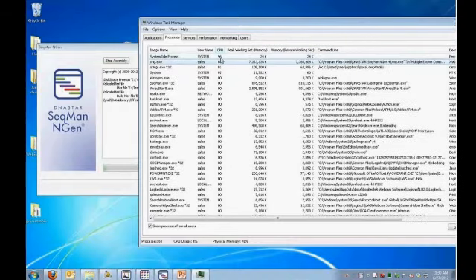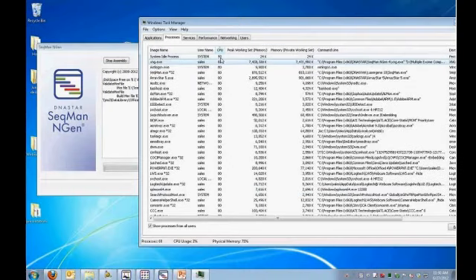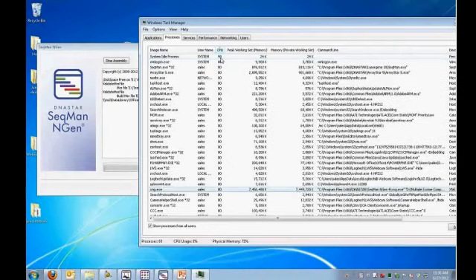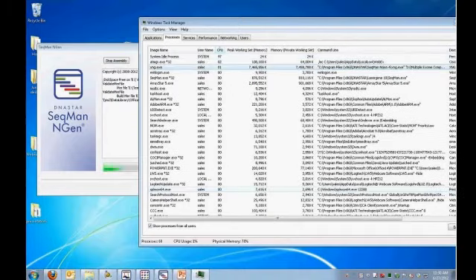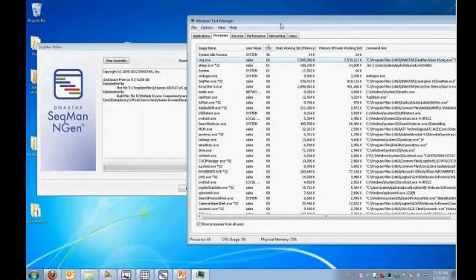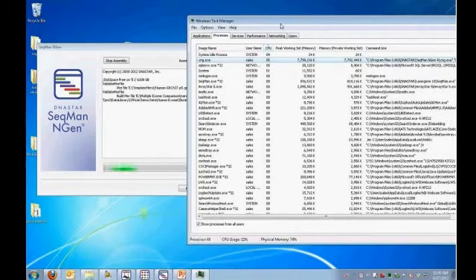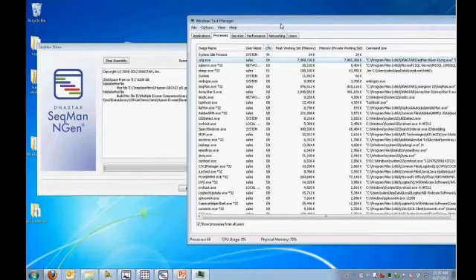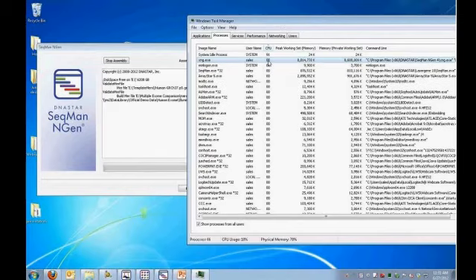So I can check my email, run a webinar. I wouldn't want to run another assembly at the same time on this computer, but it's going to give me the best possible performance here. And it's going to use a chunk of RAM. Right now it's about 7.5 gigs of RAM. And so it will balance the CPU usage with the RAM, with disk space. And again, if your computer has more or less RAM, it will dip more or less heavily. If your processors are faster or slower, it will utilize more or less processor. So it's a really great algorithm to maximize performance on these desktop computers.